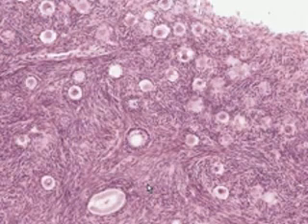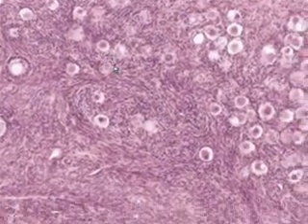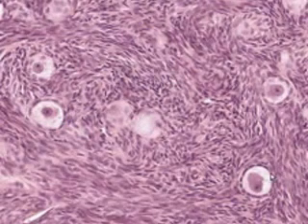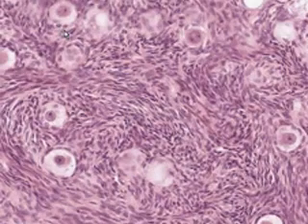When the oocytes have developed enough to have a small nest of flat or squamous looking epithelium around them, like here, and like here, and like probably here, and like maybe here, you can call those primordial follicles.